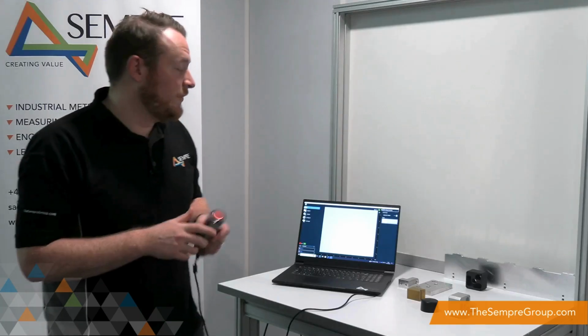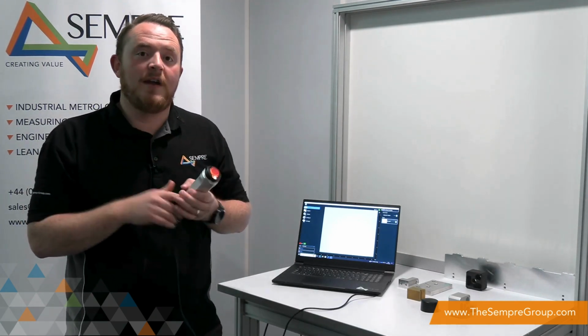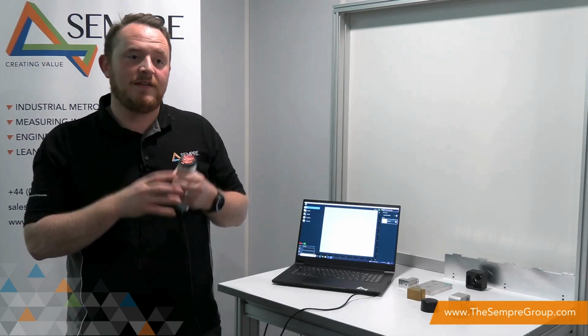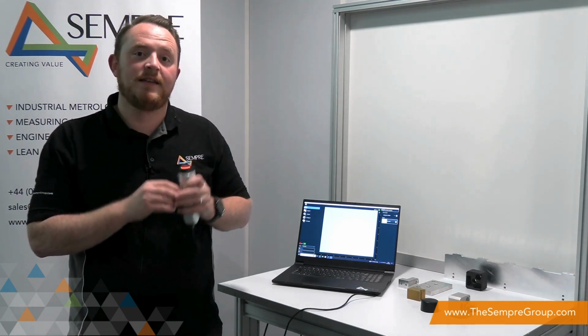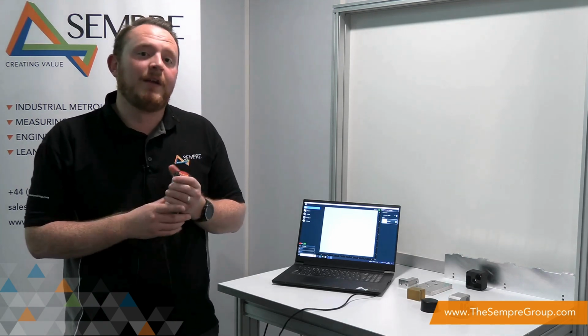take a photo. So using an algorithm called photometric stereo, we stitch those images together to create an STL file. And that STL file is what we use to create those surface characterizations, whether that be the roughness, pitting, or depth of mark. We use that data set to capture that information to create a report to understand what's happening on that surface.